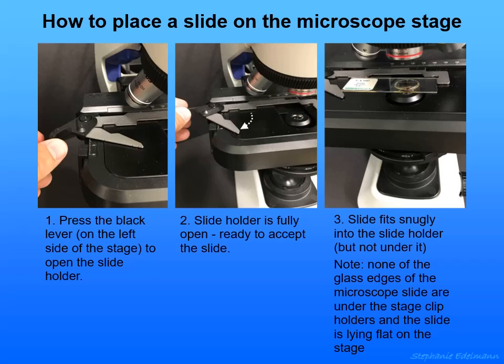The only time I've ever seen a problem is if the slide was wet. So make sure the slides are dry, because if they're wet, they sometimes stick, and the slide holder moves, and if the slide gets stuck at some places due to wetness, it doesn't really work as well.